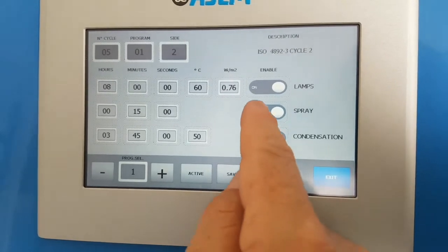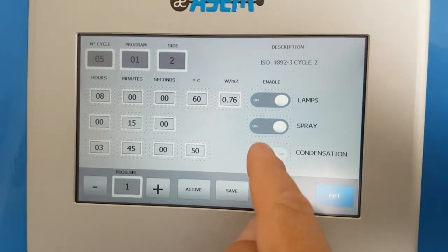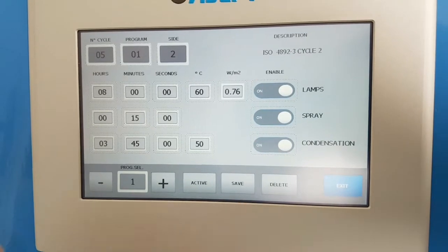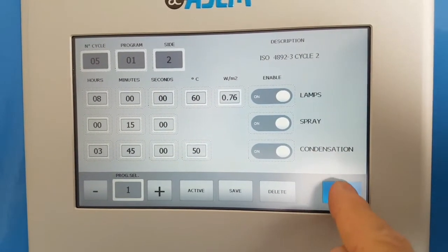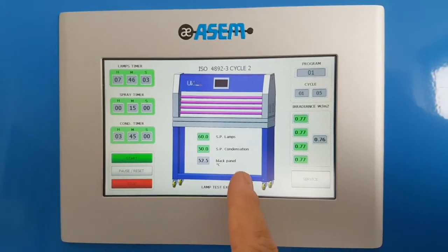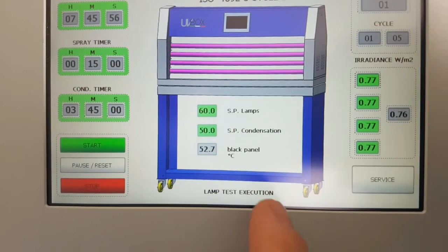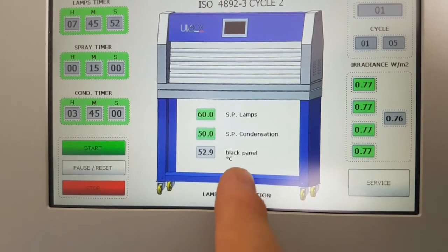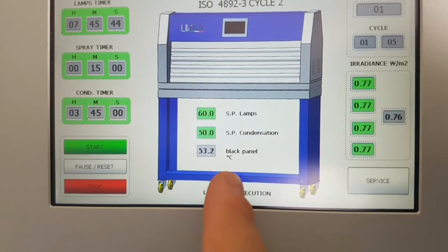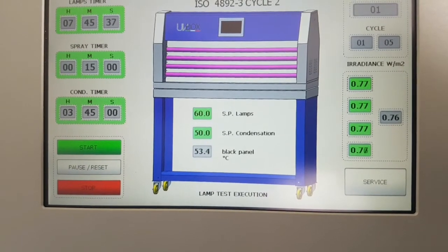If you want to modify a phase, just click to enable or disable the spray phase or the condensation phase. After each modification you have to save — if you don't save, the program still remains the same. Back on the front panel, in the center you see 60 degrees as the setting point for the lamps phase and 50 degrees for the condensation phase. The black panel shows the actual temperature inside the chamber — in this case it is 53 degrees, growing up to the 60 degree setting point.